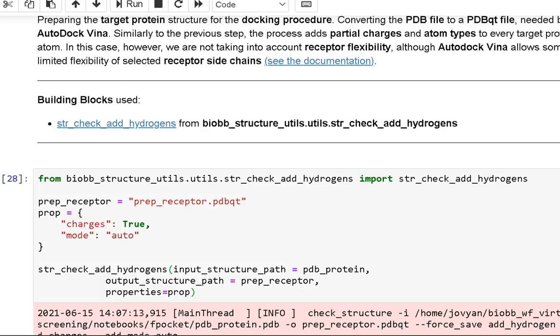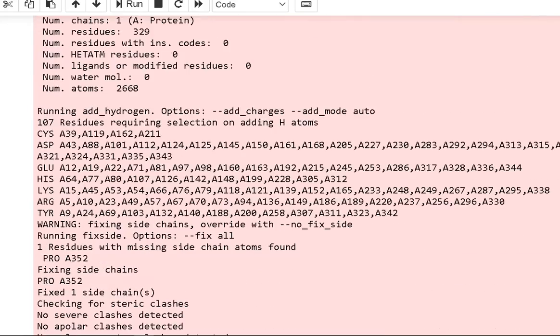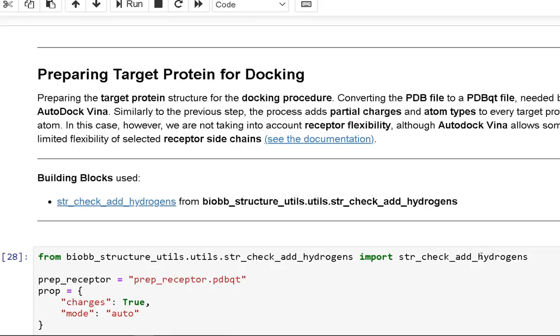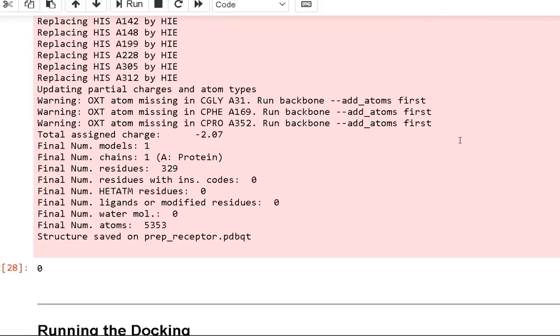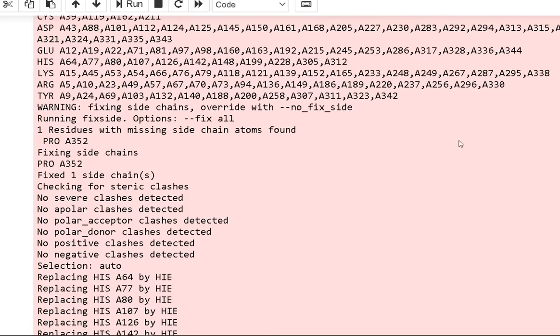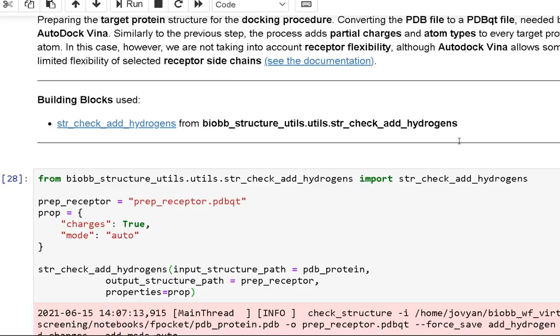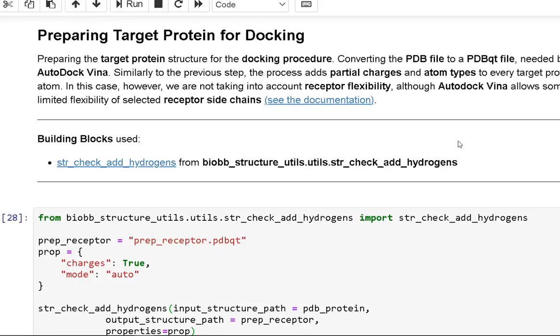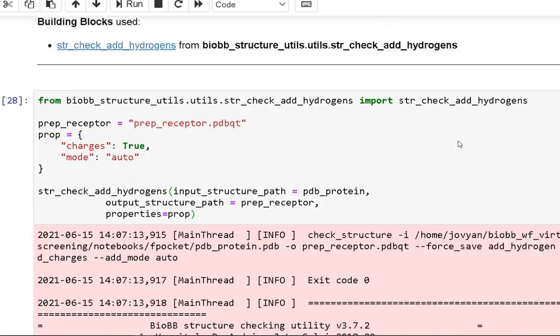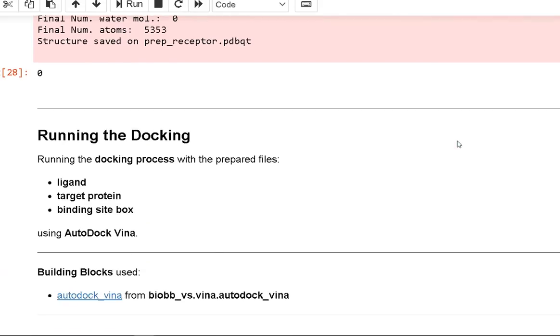The target protein structure is being prepared for the docking operation by converting a PDB file to a PDBQT file, which AutoDock Vina requires. The method assigns partial charges and atom types to each target protein atom. However, although AutoDock Vina offers some limited flexibility of chosen receptor side chains, we do not account for receptor flexibility in this tutorial.